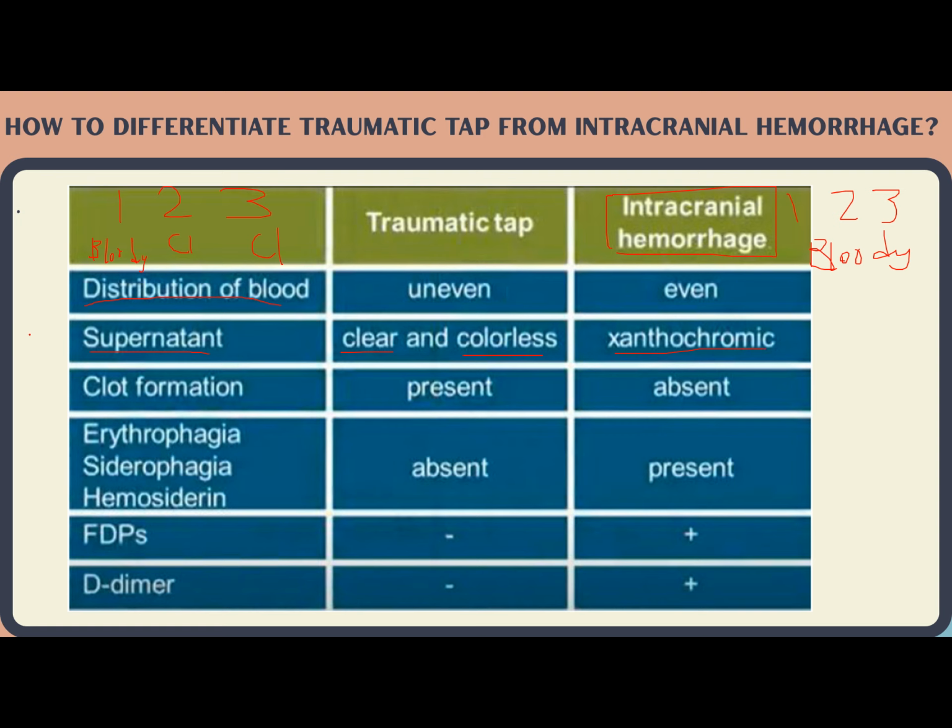Di ba ang supernatant nyo? This is, when you centrifuge a sample, at the bottom would be the sediment. Then the liquid portion here, itong liquid dito, this is now known as your supernatant. So to simplify, class, your supernatant is just purely liquid. No cell contents, no solid contents in it.